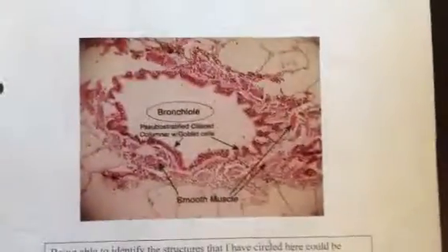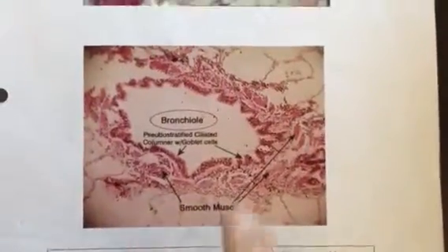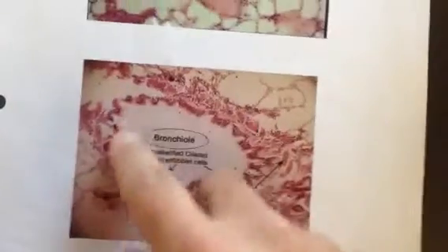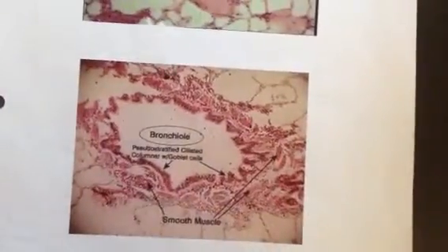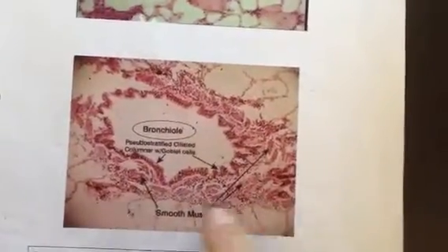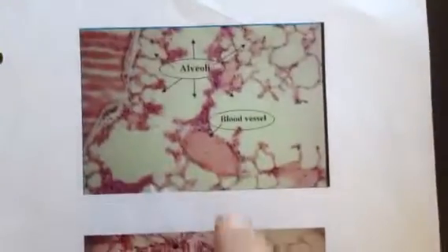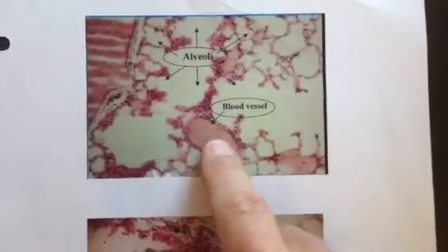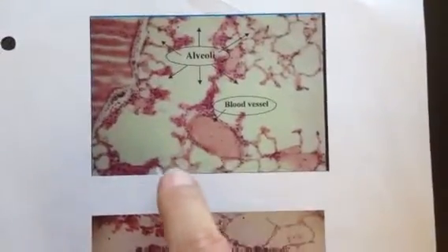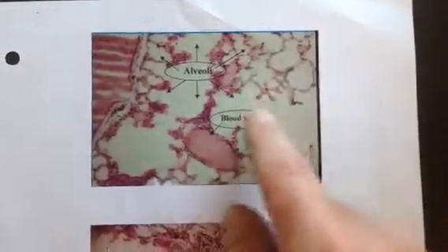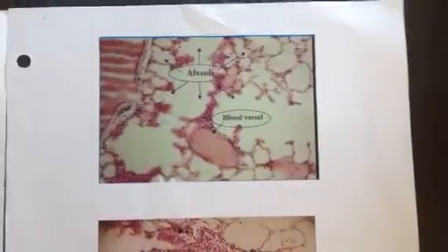Let's take another look at a different slide. This is another slide that represents a bronchiole. In this one, I don't have an easy picture of a capillary, but — there's a blood vessel there. And you can see some of the matrix of the alveoli that's out there.